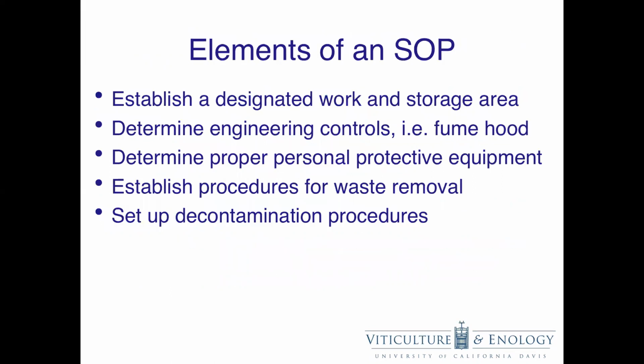SOPs establish a designated work and storage area, determine engineering controls such as fume hoods or flammable cabinets, the proper personal protective equipment for working with certain chemicals, establish procedures for waste removal, and set up decontamination procedures.